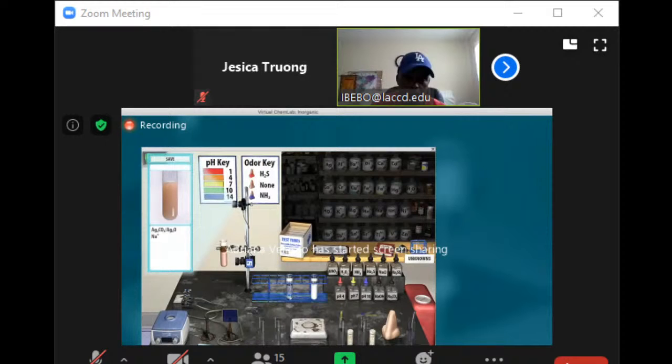And I'm asking, it's not this, correct? You're telling us that we need to. No, this is telling you that this is what happened there. Silver carbonate is the product. That is what is in the precipitate. This part here is what's inside. Right. Okay. All right.